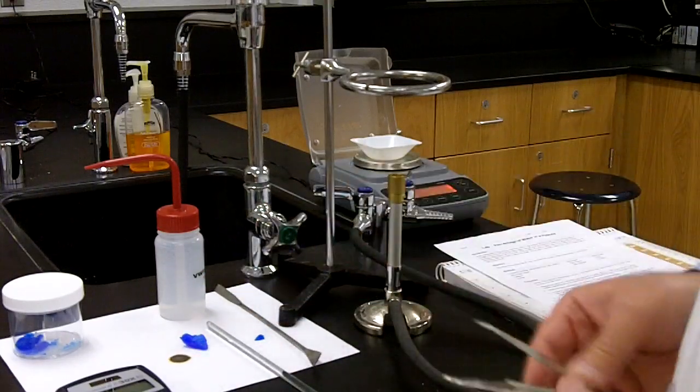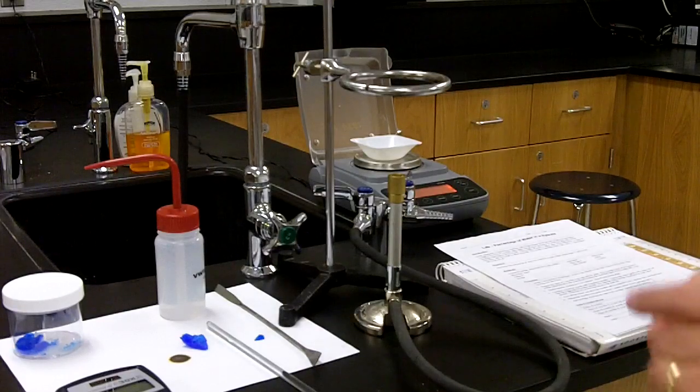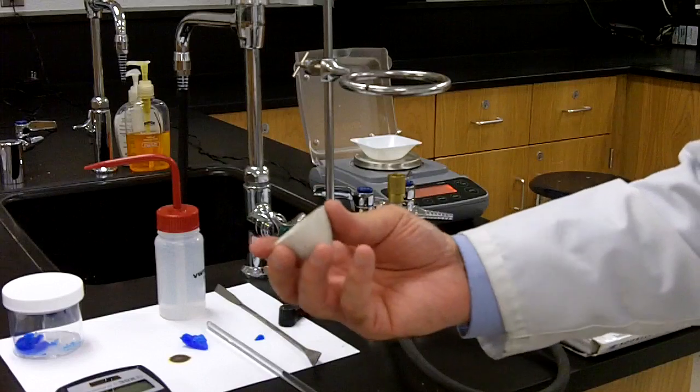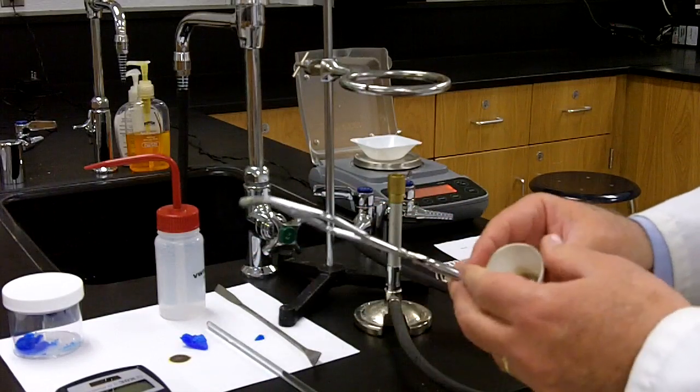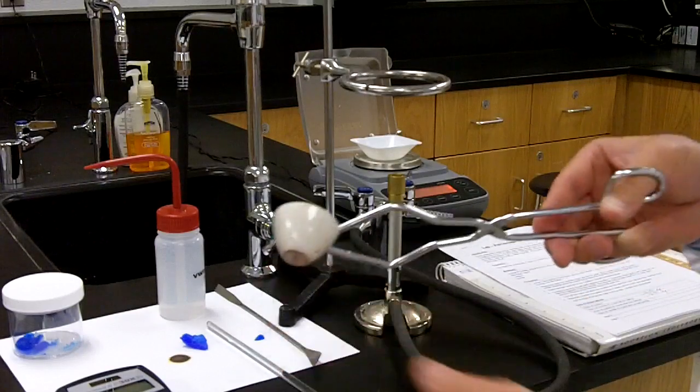The first thing we're going to do is we're going to get a mass of a crucible. And a crucible is just a small ceramic vessel, just like that. It is able to withstand a large amount of heat because we're going to be heating up the copper 2 sulfate pentahydrate.